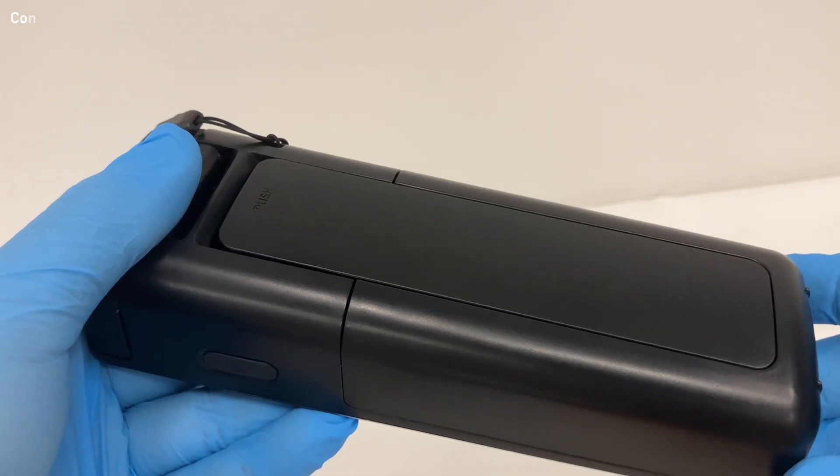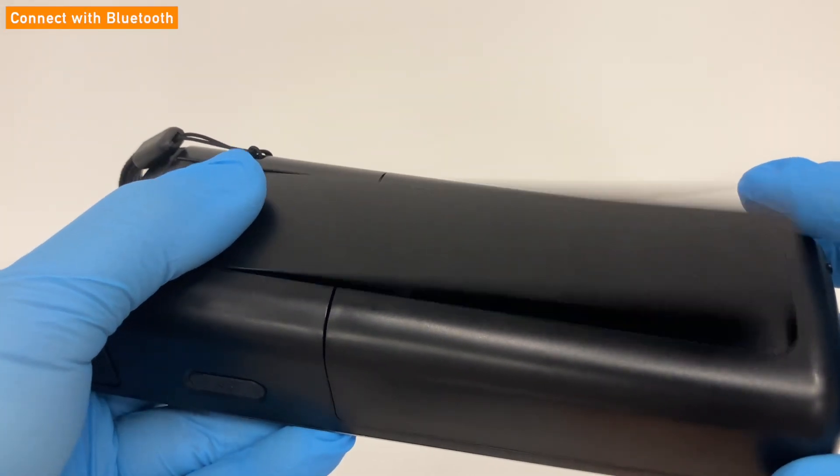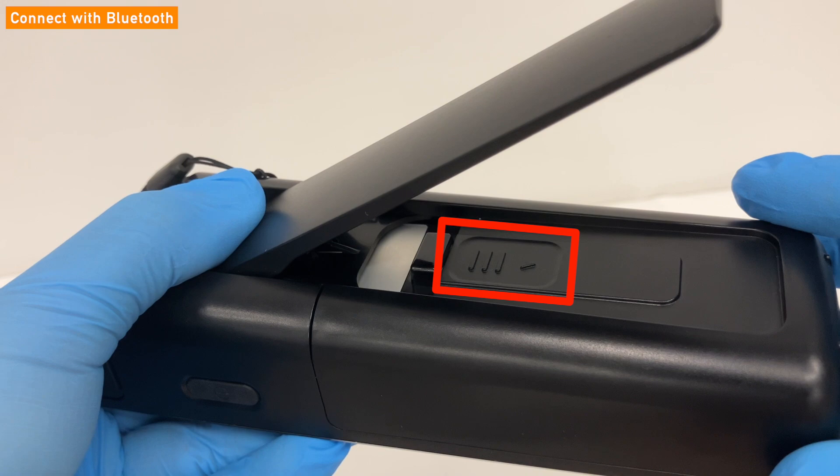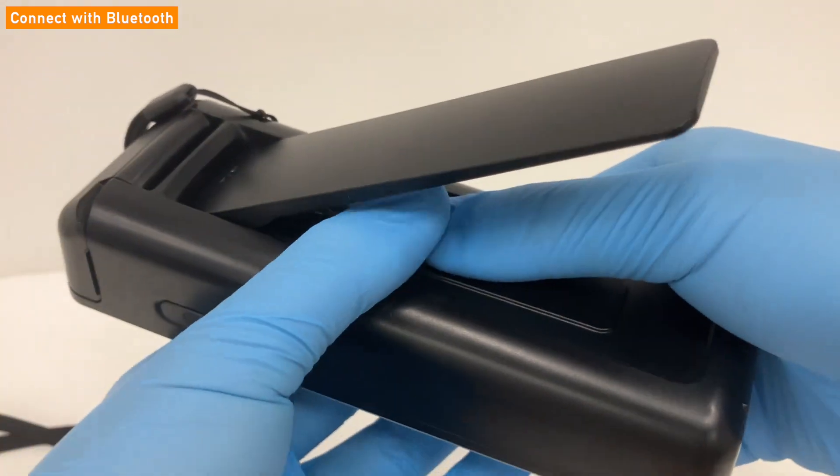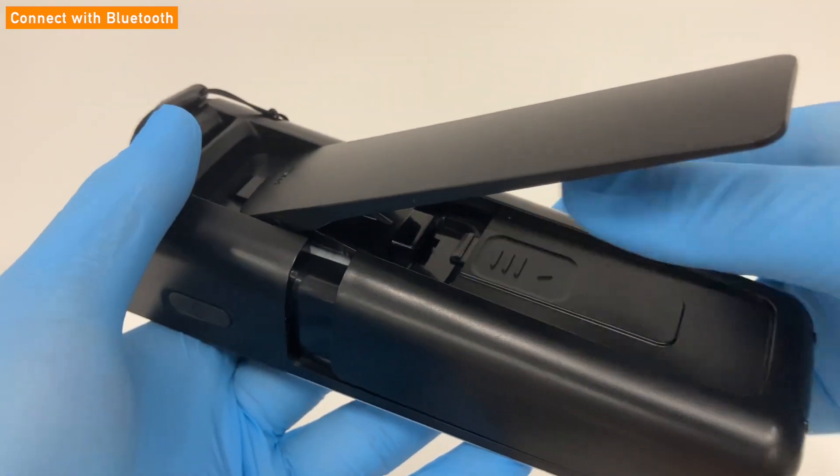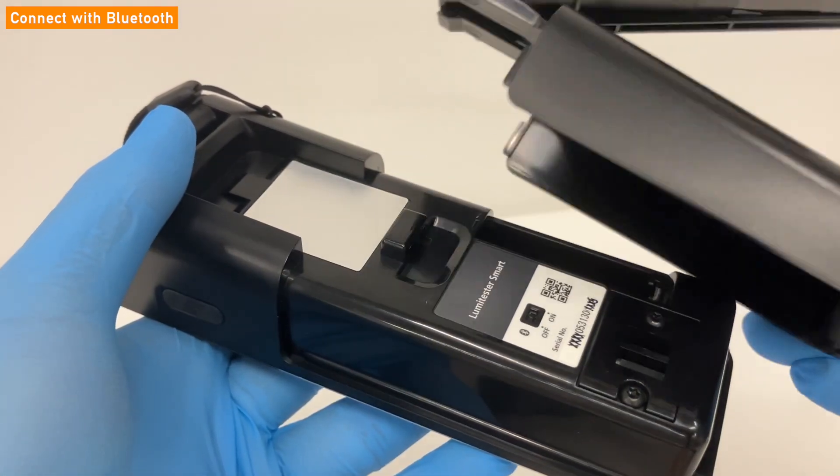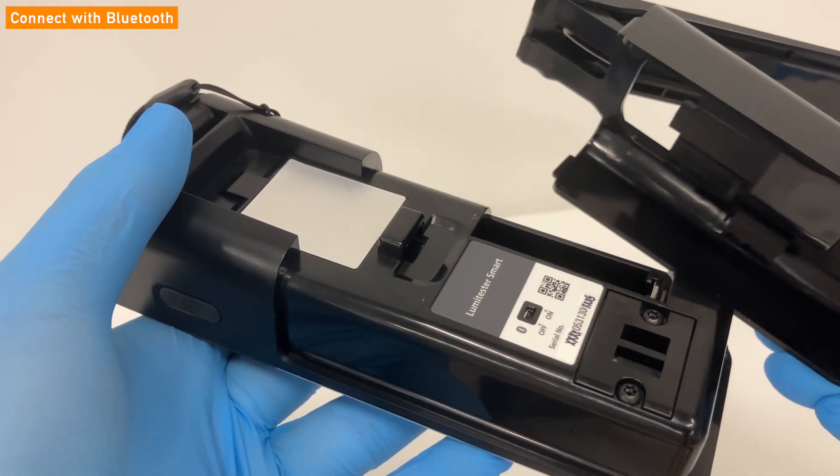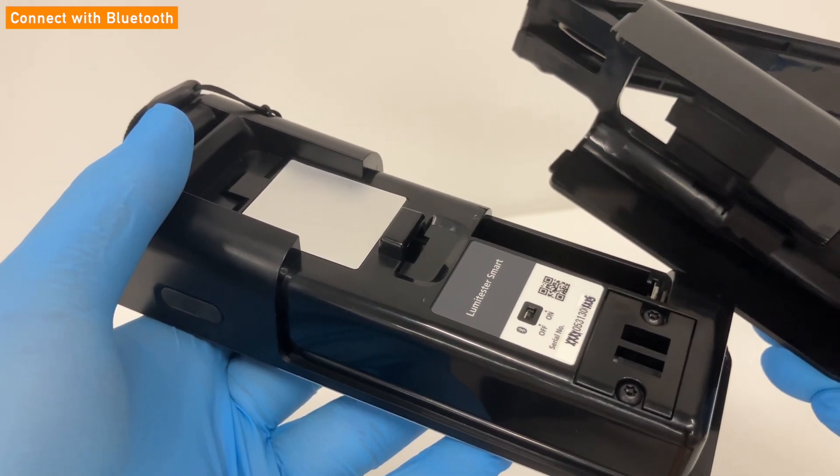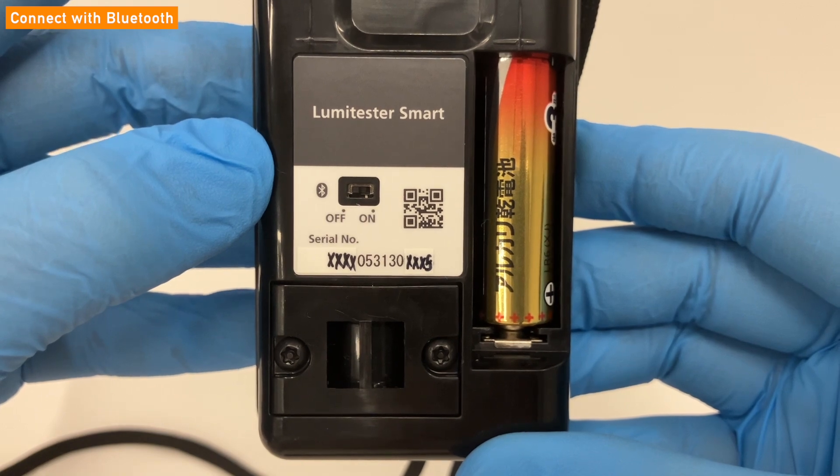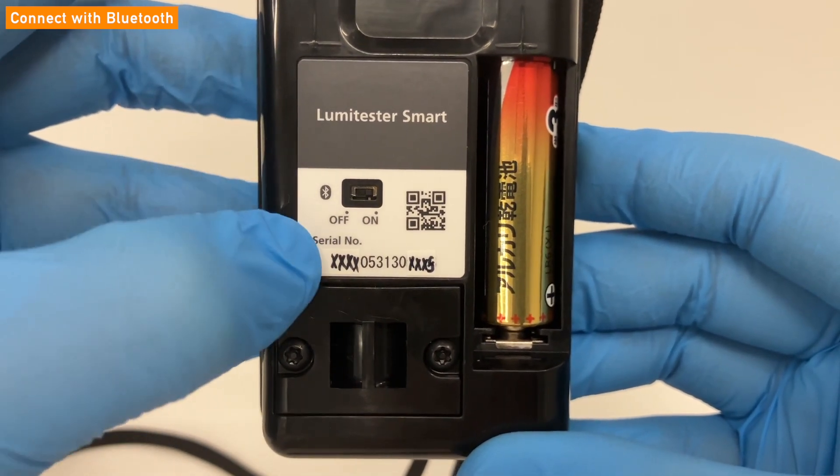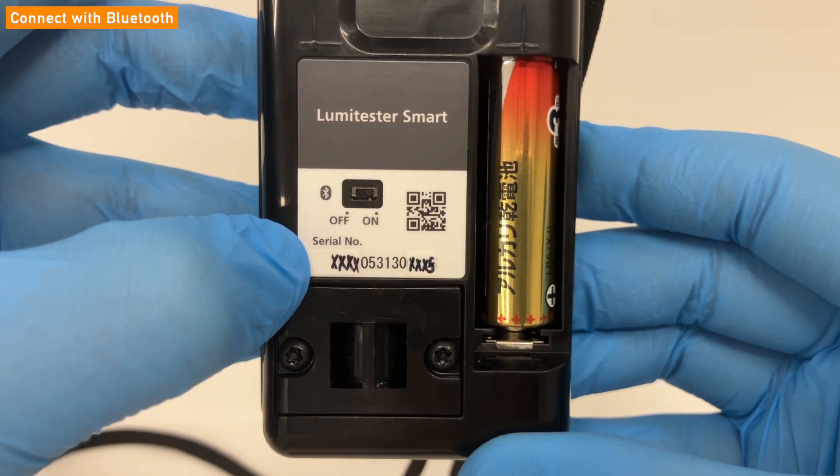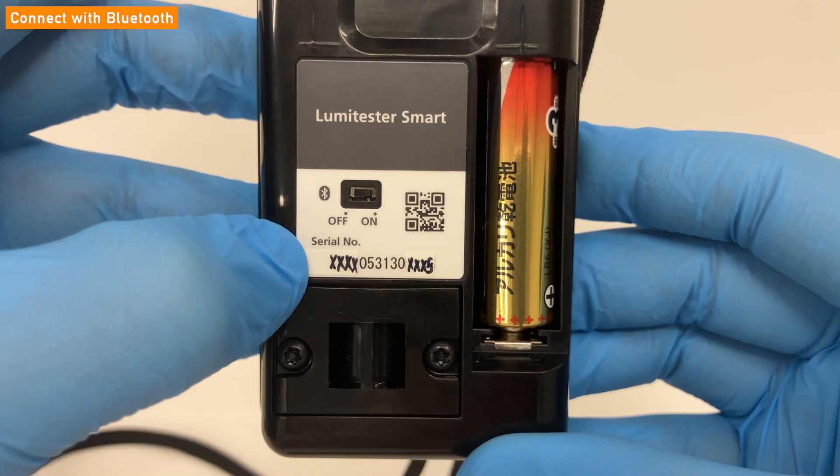Next, we will explain how to connect with Bluetooth. First, please remove the back cover of the Lumetester smart. On the surface of the back cover, there is a mark of three lines. Press the mark with your finger, and slide it down to remove the back cover. Then, please check the serial number, and make sure the Bluetooth switch is turned on. After that, put the back cover back on.